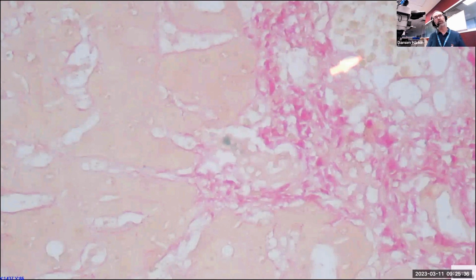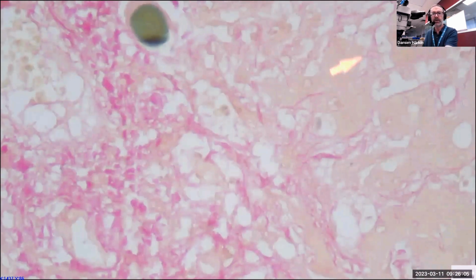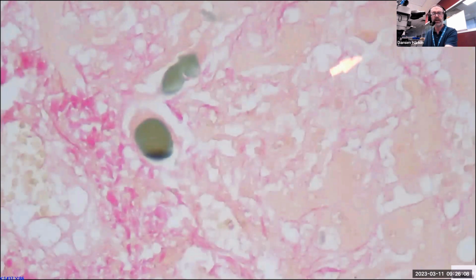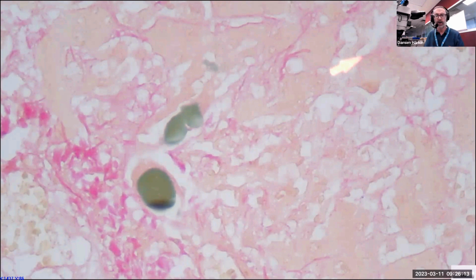So this is applied right at the end, okay? So you do your Hall stain, get the color reaction, and then a couple of minutes in the Van Gieson solution, very rapid dehydration. You need to be very careful not to wash out this counterstain. So it's very brief, dips in absolute alcohol straight to xylene. And in fact, we normally blot the slide first before we go to the absolute alcohol. And this is the outcome that you get. So it's a really nice, straightforward stain. And as I said, it is a classic method for demonstrating bile.